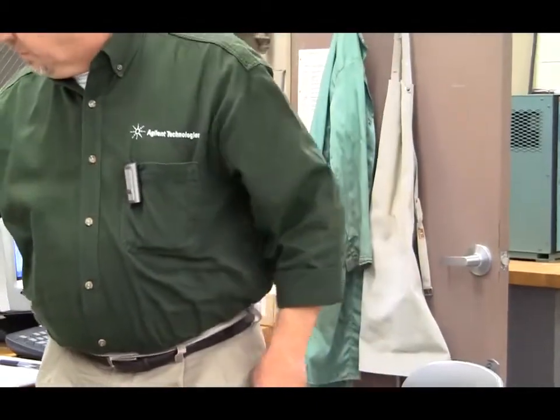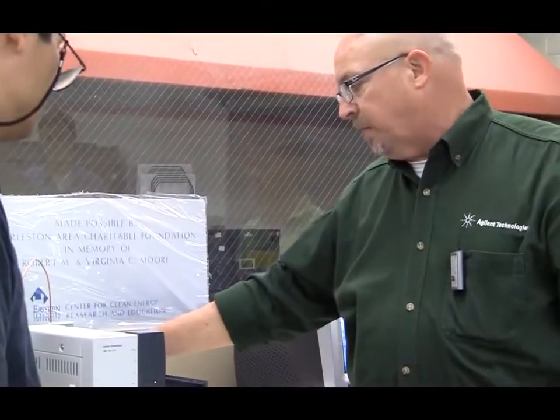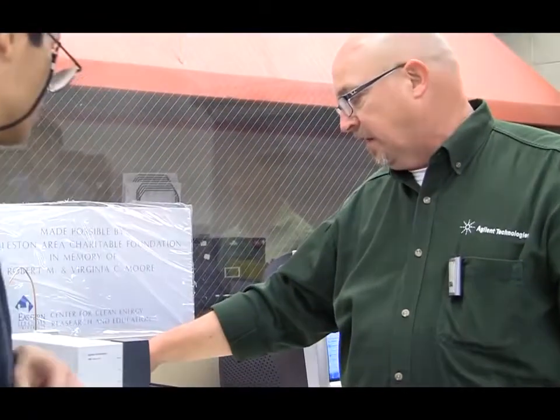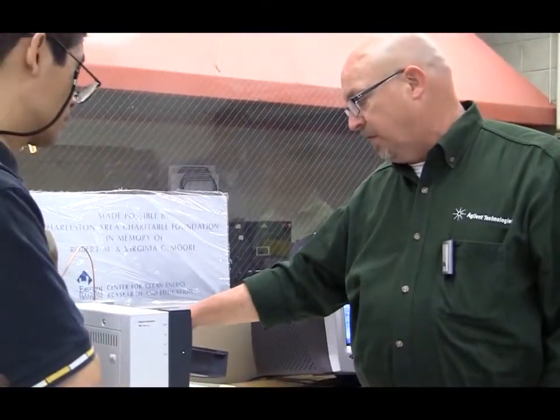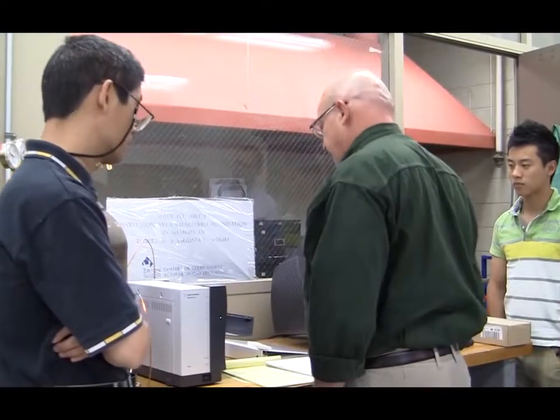Another thing you need to remember about the Micro GC: don't put water on it, don't put any liquids in it, don't put any particulate matter in it. There are actually two filters on this system. One of them you can see on the outside when Bert set it up, which is right here. It's a little 5-micron frit that's exchangeable. So if you see that you're not getting sample in, you might want to check that frit and see if there's anything on it. There's another exact match for that 5-micron frit inside this fitting. Don't ever get anything in there because you have to replace this fitting. That's why we have the external filter on it.